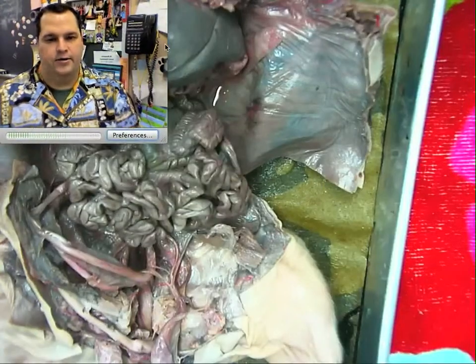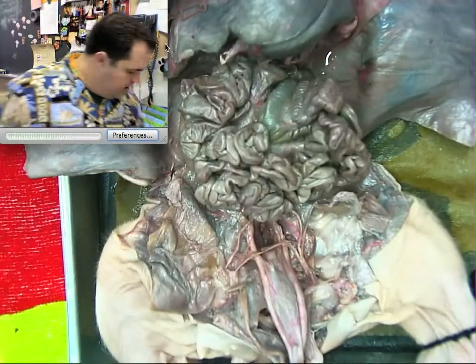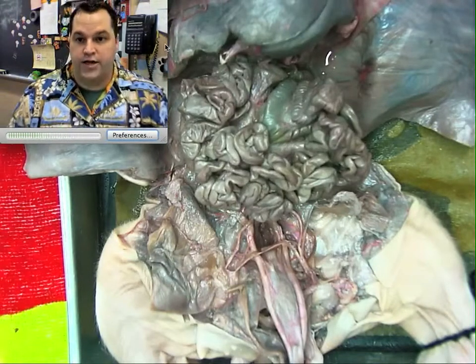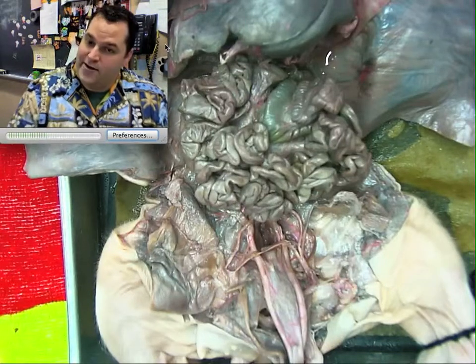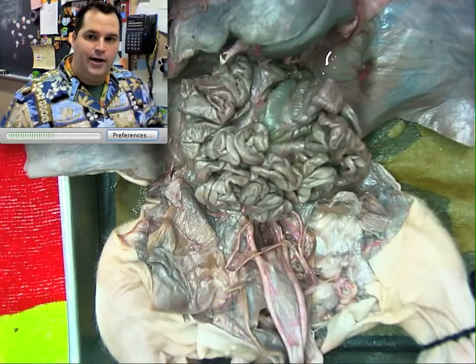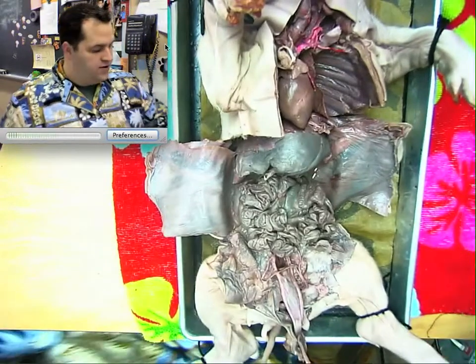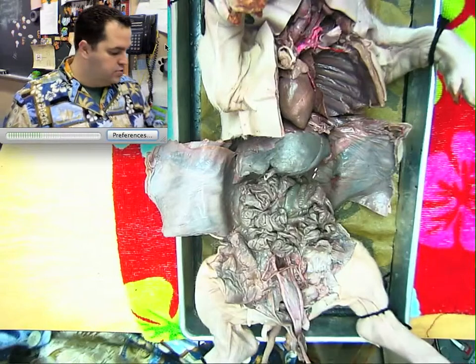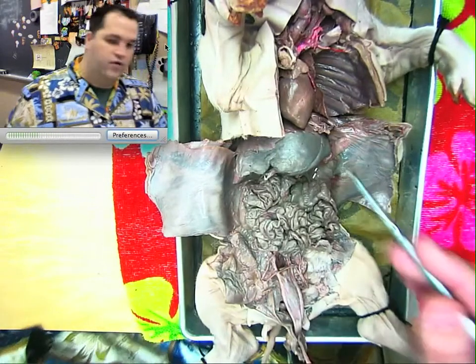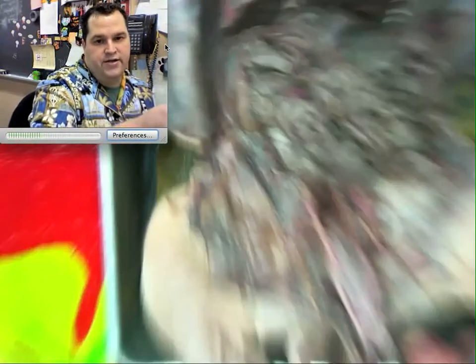Let's start with our friend Lil' Fetus. You'll discover very quickly that Lil' Fetus is not going to be sufficient today because he's only holding half of what we need — he's our male specimen, and we have a female specimen waiting to take his place. If we take a broader view of the pig, we've got the thoracic cavity, the abdominal cavity, and we're going to be concentrating in the lower half of the abdominal cavity.